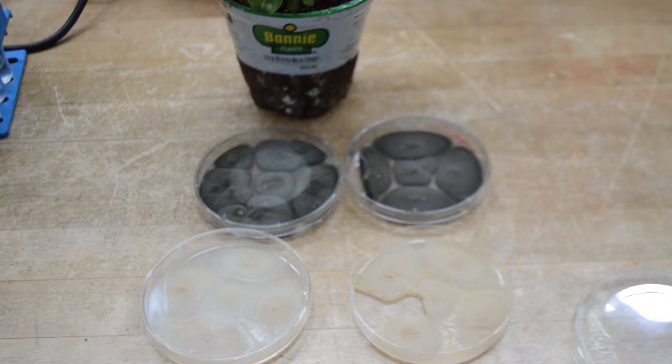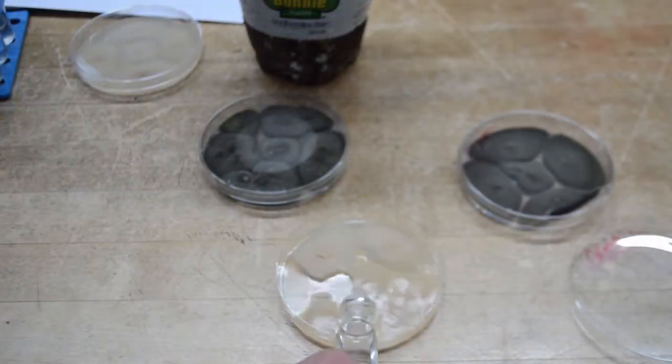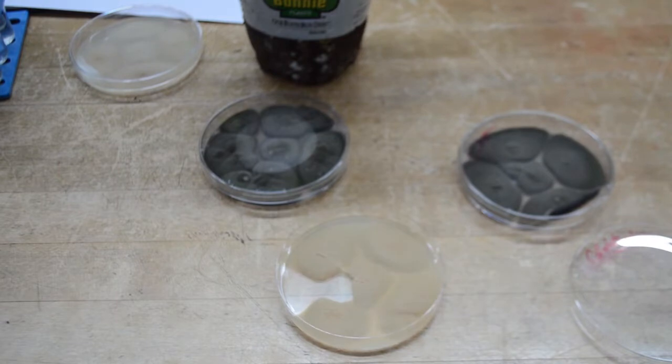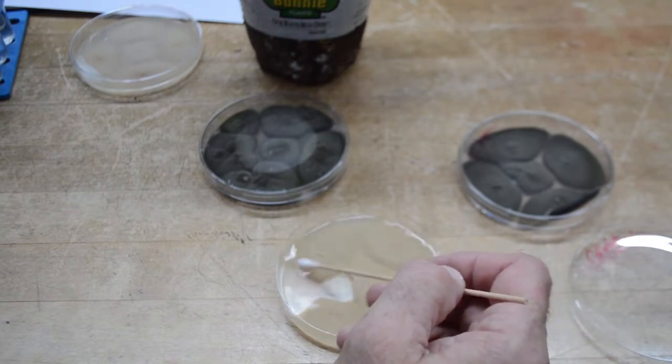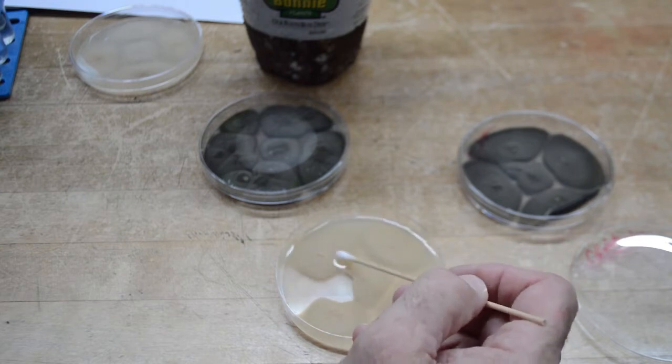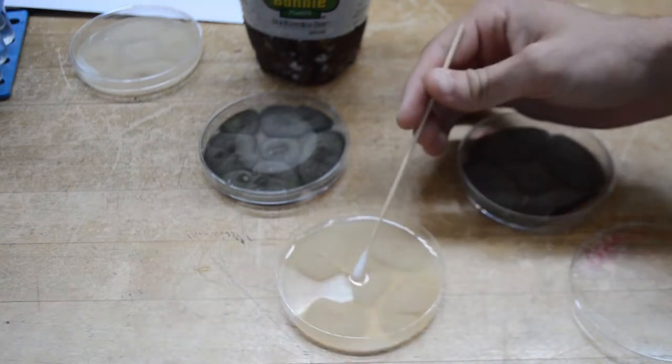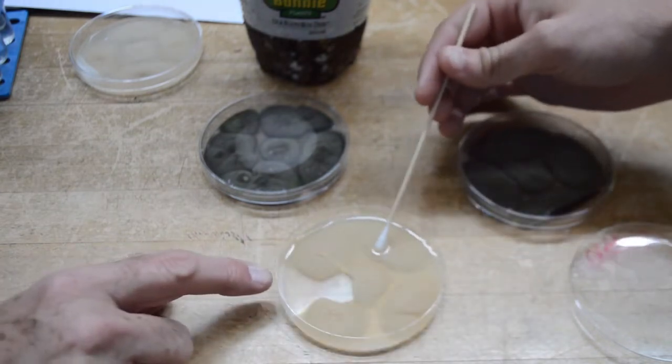We isolated two different fungi from the lesions, so we will test both fungi. The fungi are harvested by adding water to the colonies, then gently brushing the colonies to dislodge the fungal spores. You can see how the water is becoming cloudy.